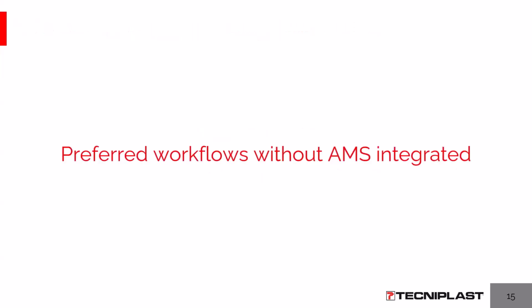We know perfectly that not all the DVC users are fully integrated with an already existing animal management system. And as said, obviously, the DVC must work also in this situation. Unfortunately, and obviously, with a little bit more effort, let's see our preferred workflow in this situation. So regarding step number one for the cage life workflow, the cage registration, we have already two options.